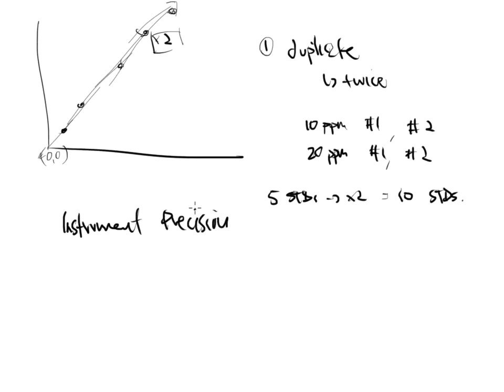Right? So in a general chemistry class, we often talked about precision and accuracy. Accuracy is how close it gets to the bullseye in the center or your true answer, and precision is how close the darts are to each other when you throw them. So if it hits the dartboard at the same spot every single time, we're good to go, right? That's called precision. Precision and accuracy have nothing to do with each other. So that basically means that I could be very precise in a lab and not get the correct number. In other words, I could throw my darts at the dartboard and they all would hit the same spot, but that spot is not the bullseye, right?